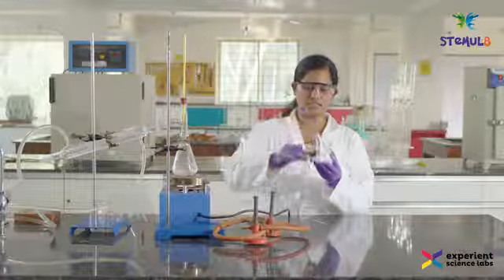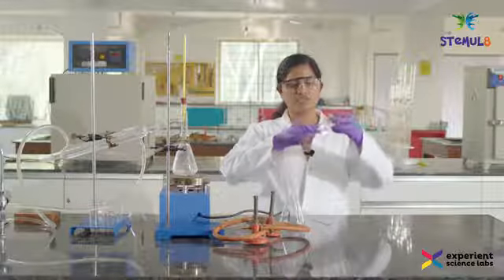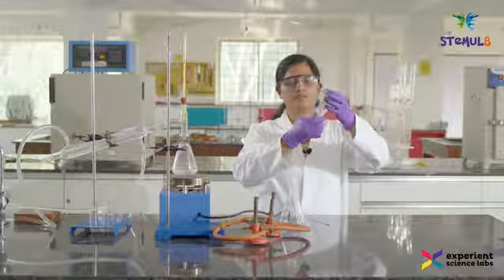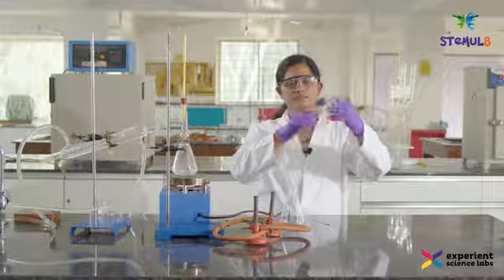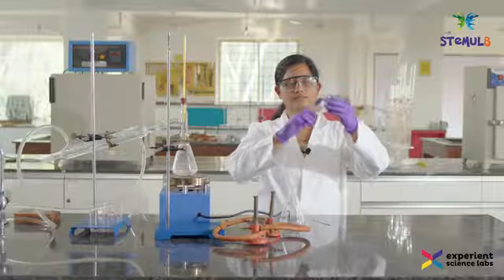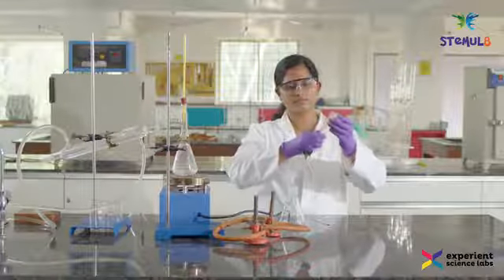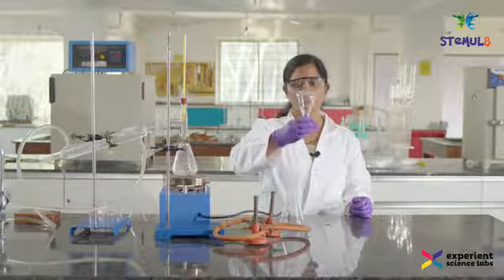Transfer a little bit, and then just rotate your conical flask so that the ethanol gets dried up. Now you see the conical flask is dry.